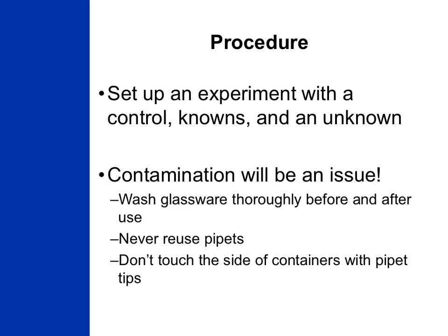One of the things to be aware of with this lab is that contamination is going to be an issue. So you need to make sure that you wash your glassware thoroughly, both before and after use. Make sure that you never reuse any pipettes, and you definitely don't use one pipette and then put it into the next solution or the next container. Also, make sure that you're very careful when you're dispensing reagents that you don't touch the side of any kind of container with that pipette tip, because that's going to contaminate your solution and our stock solutions as well.